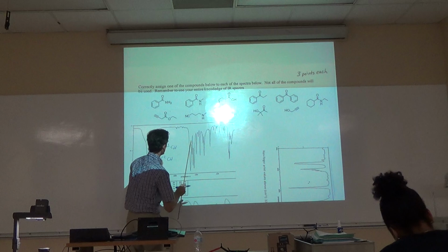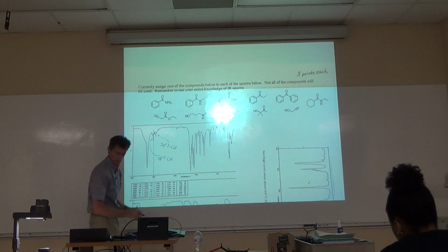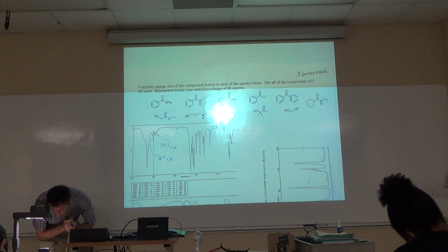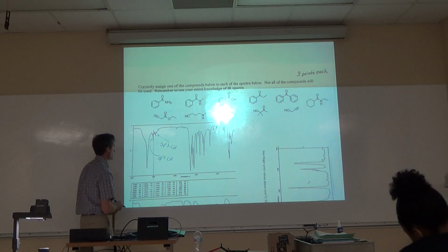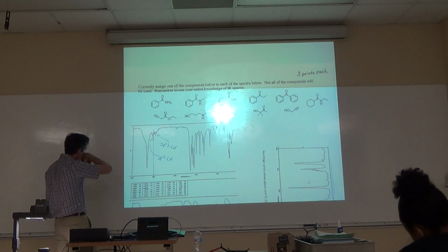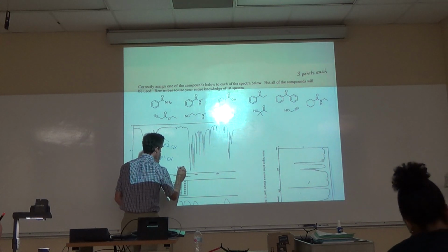And is that a carbonyl? Yeah. What is that, 15, 16? Is that 16 something? 1645? Comes down to 77. No, wrong one. 1639. Comes down to about 4. 1639? 1639, is that what that is? That could be a carbonyl, it's pretty darn low.